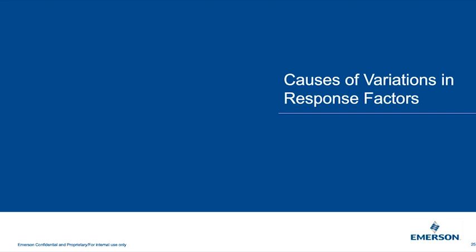So the response factor deviation is really more the change in the response factor. And the response factors are impacted by the peak area as well as the concentration. So again, it's not a direct correlation. If your retention time shifts, say, we go back to that example somebody asked about, if you increase the carrier pressure, your retention time will shift. Or I should say, it actually will pull in. If you're rushing it through, things will come out sooner.